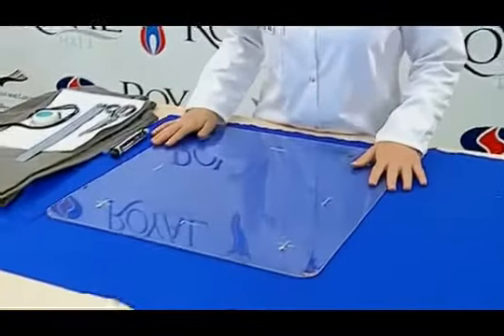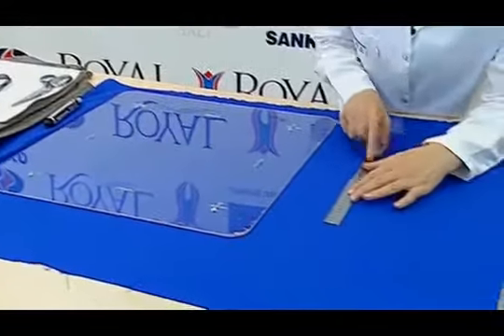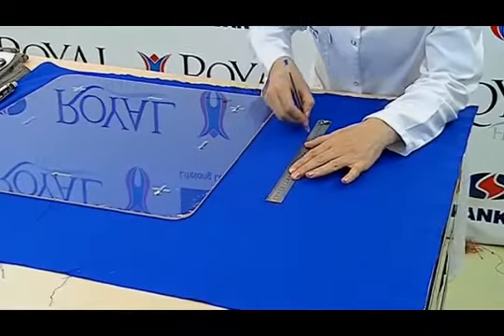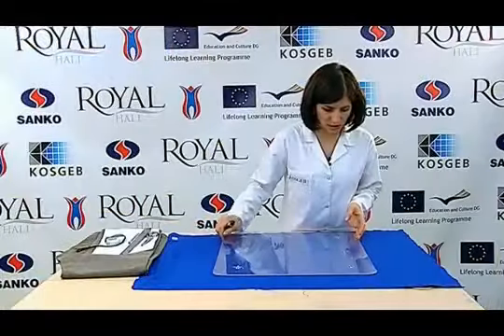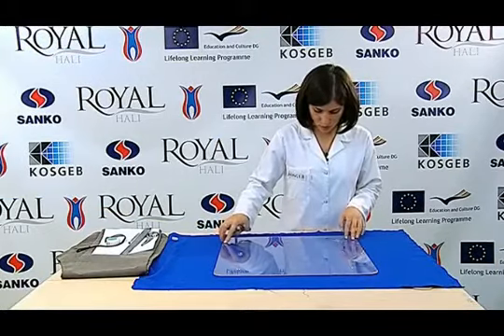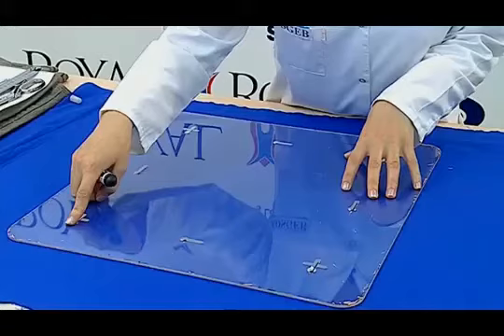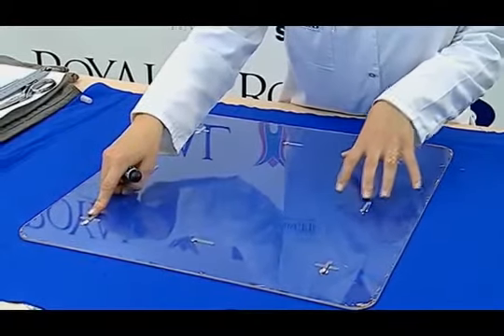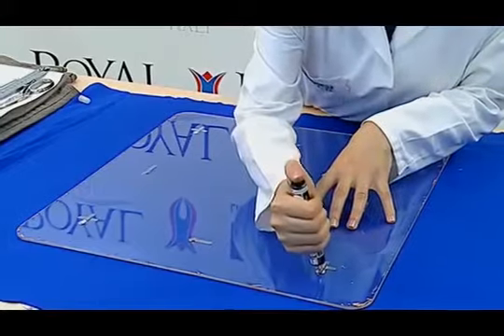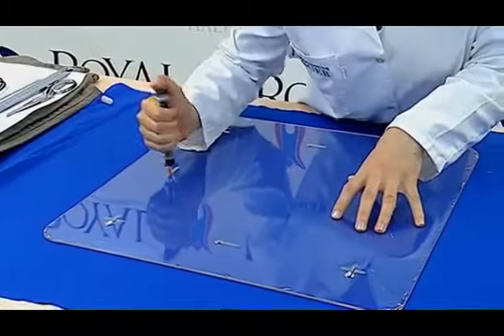The dimensional change template is placed on the fabric. A mark is made in the warp direction of the fabric. Our templates are placed according to this point. After making sure that the warp and weft directions are regular, we mark the pattern between the marked pairs with an ink pen. The distance between the marked pairs is 350 millimeters. Each point is prepared with marking.